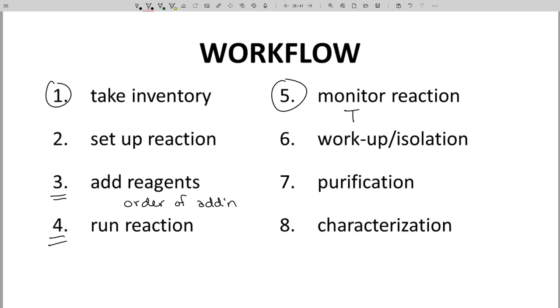One of the most common techniques for checking a reaction is not to poke it with a toothpick, but to take a TLC of the reaction mixture. By TLC, you can check for the disappearance of starting material. Once the starting material is gone, the reaction is likely complete. Not all reactions need to be monitored, but it's very common. You can't always assume that a reaction is finished once a certain amount of time has elapsed.